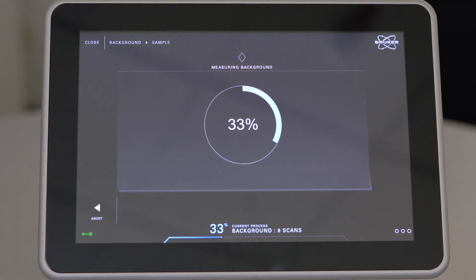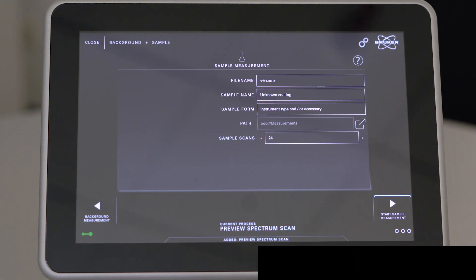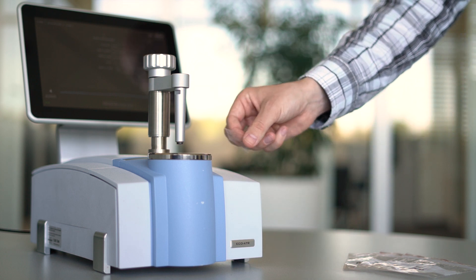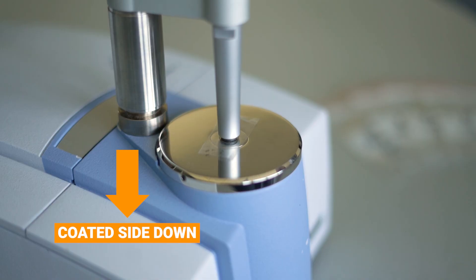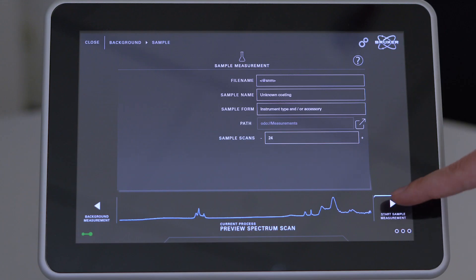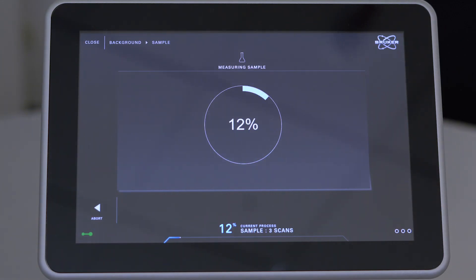But first, we take a background measurement. To analyze the coating on this snippet, we place it with the coated side down on the ATR crystal. Next, we start the FTIR analysis by clicking Start measurement in the software.